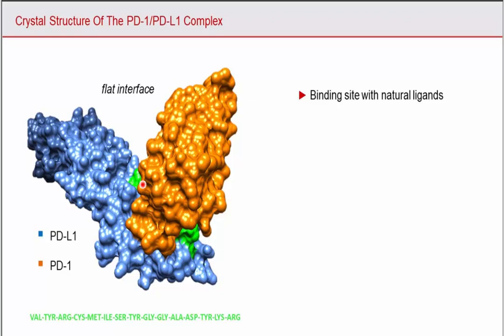I'm not a molecular docking expert, but this is just to show a very quick overview of the PD-1, PD-L1 binding. We determined a 15 amino acid sequence, in green, involved in the binding of PD-L1 with its ligand. The question was, what if we remove this 15 amino acid sequence? Do we keep the binding between our two proteins of interest?